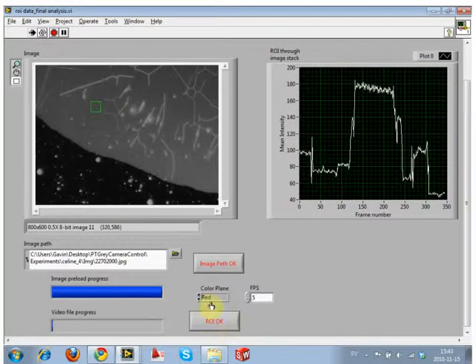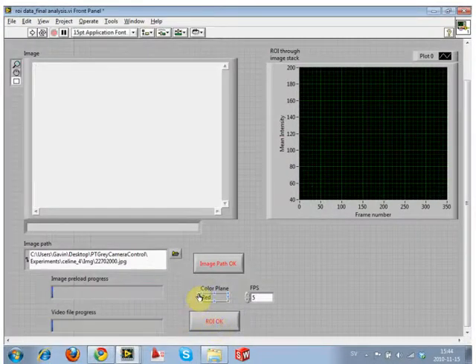And this time we're actually doing it the correct way for a lot of data sets, which is we're not dumping an RGB image into an 8-bit memory location. What we're actually doing is taking an RGB image and extracting a color plane. So in this, we're extracting red. And we have multiple options here. You have all of the RGB levels, but you also have the HSL levels. So you have red, green, blue, hue, saturation, luminosity, and then value. The value is for 64-bit images, which have a fourth channel.